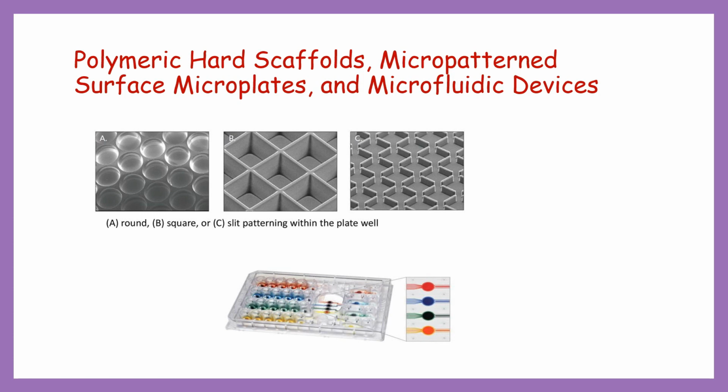Microengineering of microfluidic devices also allows for the development of organ-on-a-chip platforms. 3D tissue models have been described for a variety of organs including skin, muscle, liver and neural tissues, bridging in vitro cell culture and in vivo animal models. With the advancement of these 3D culture technologies, organ-on-a-chip platforms are poised to provide advanced tools for drug development and high throughput screening in the future.